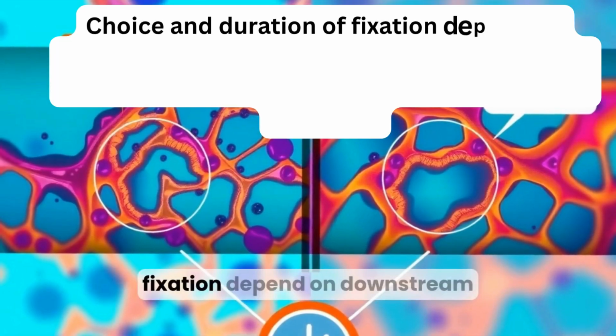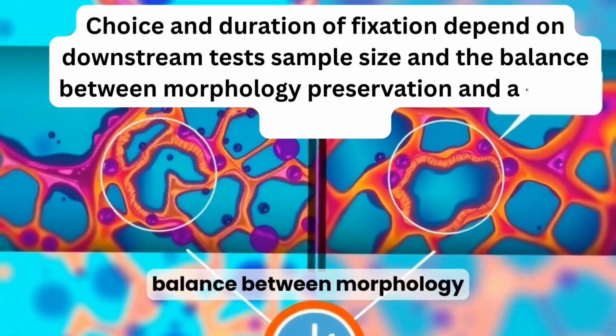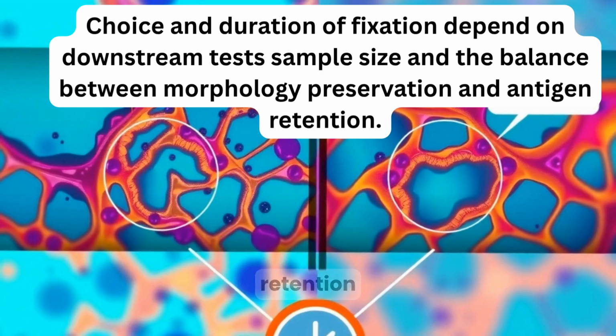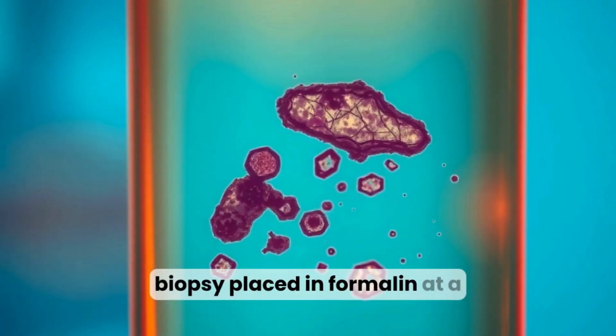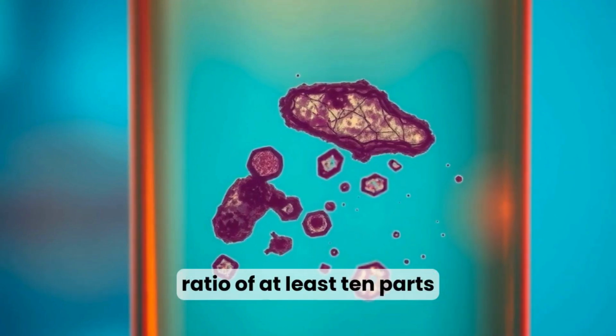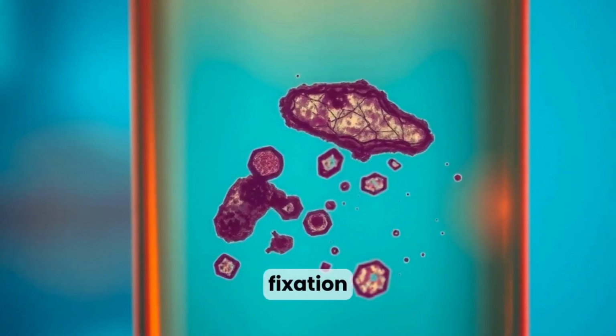The choice and duration of fixation depend on downstream tests, sample size, and the balance between morphology preservation and antigen retention. Practical example: a small biopsy placed in formalin at a ratio of at least 10 parts fixative to 1 part tissue helps ensure consistent fixation.